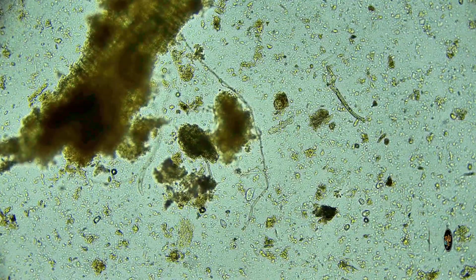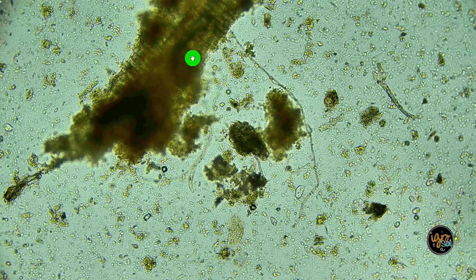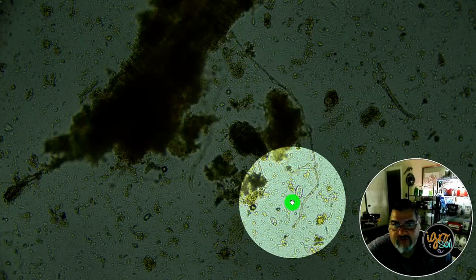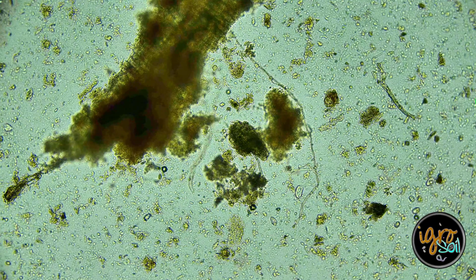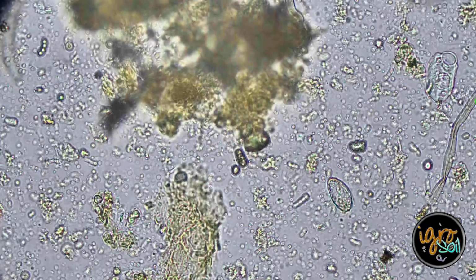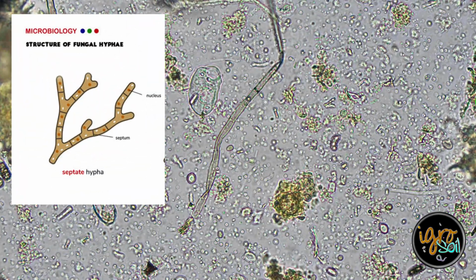Look, here we go. We're going to dive into this fungal, this whole strand here. This one right there. I think that might be fungal. I keep hitting all these buttons. I didn't even know I had that video button until the other day, or maybe a week or two ago. So if you're looking at the color of that already, it's got a brown tinge to it.